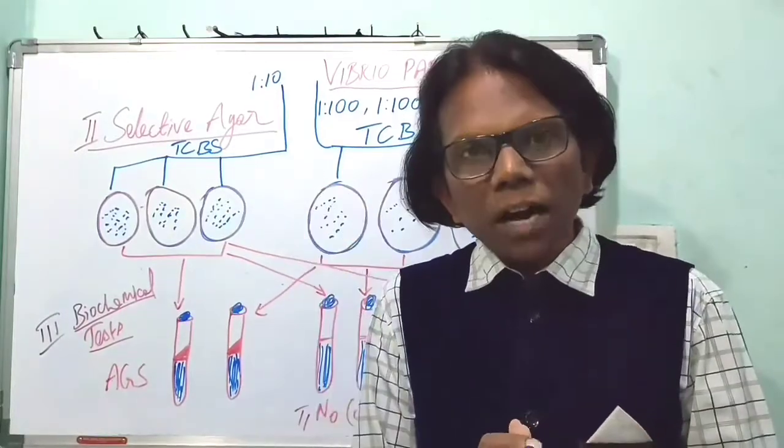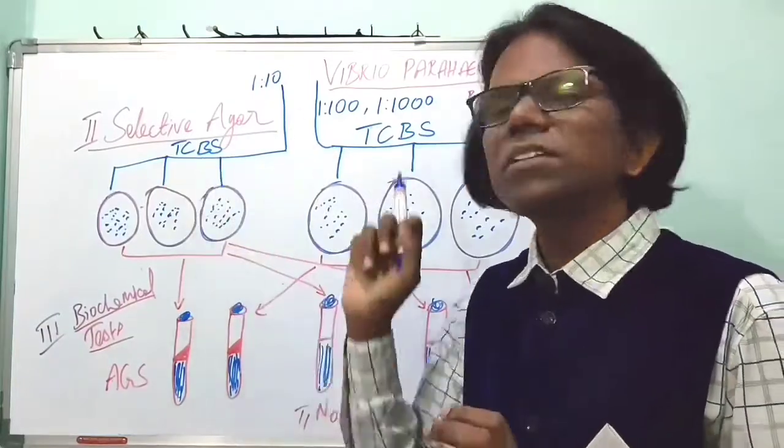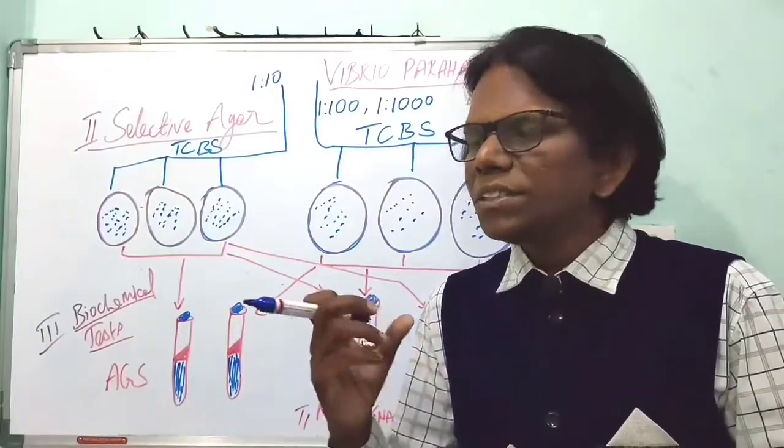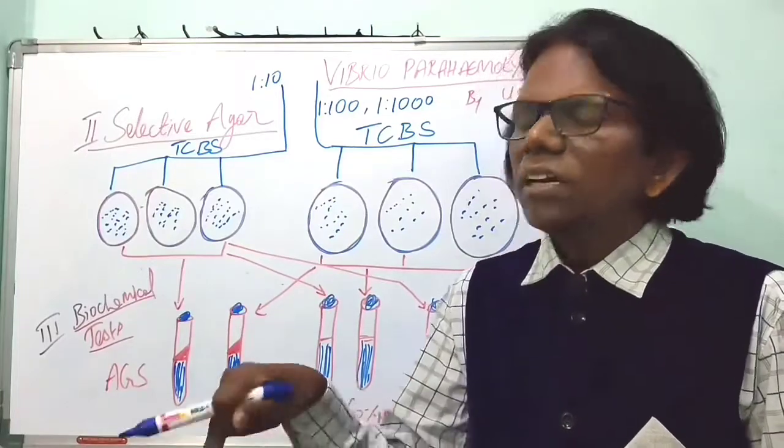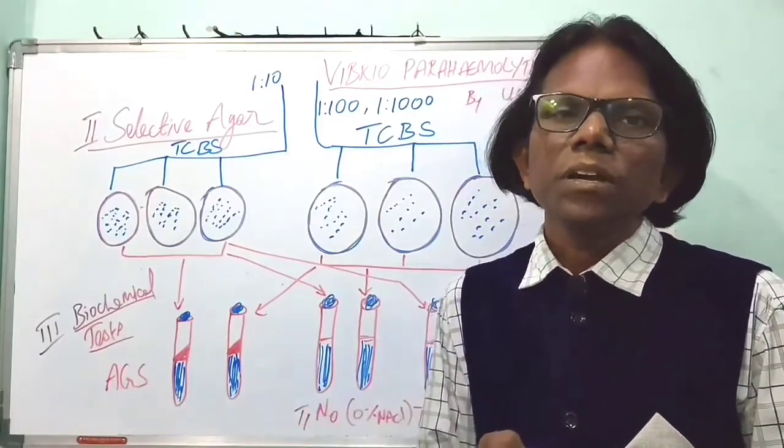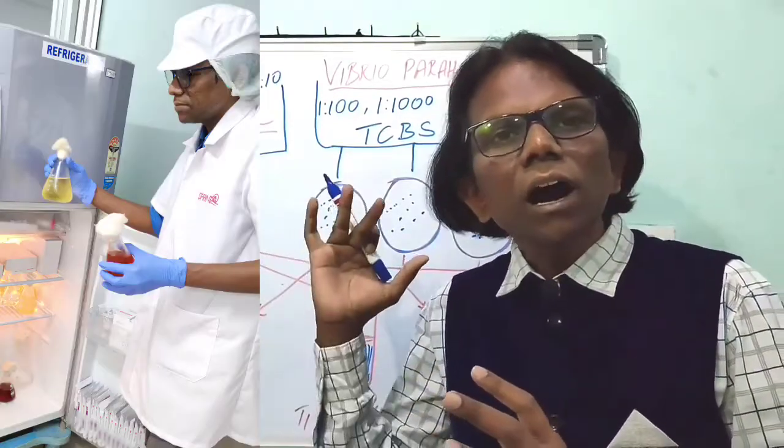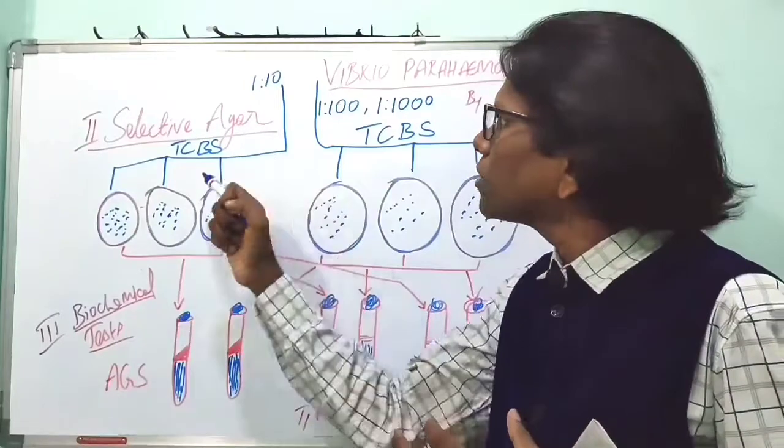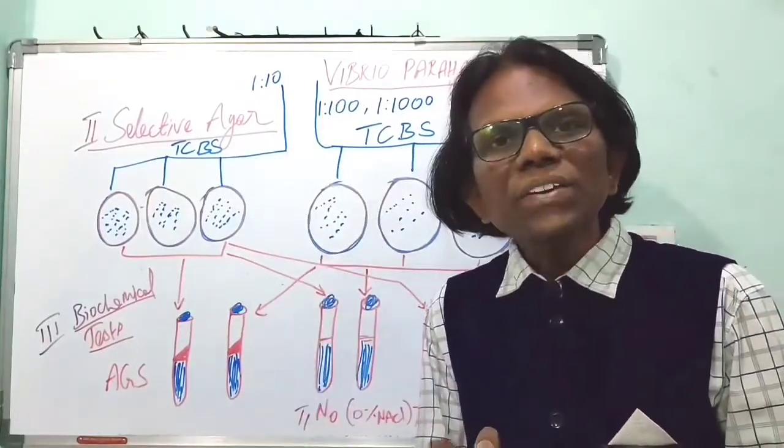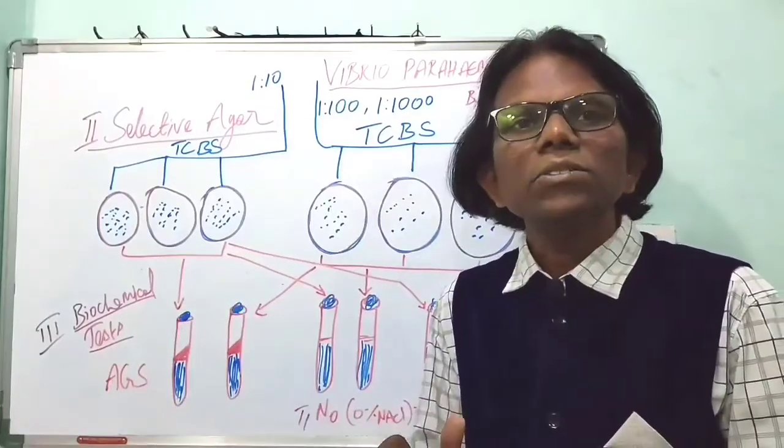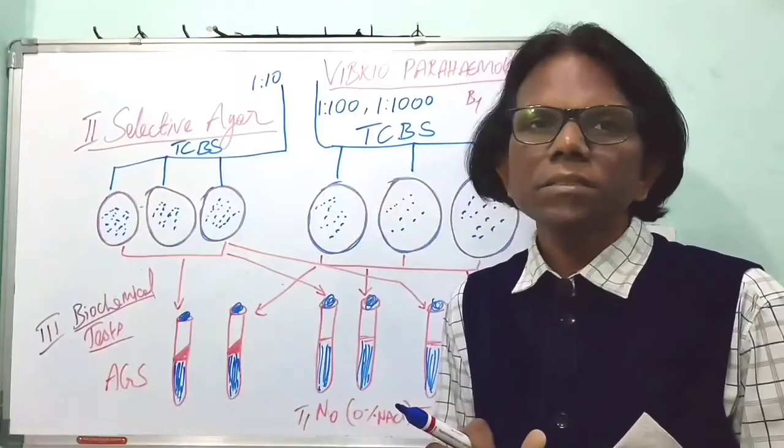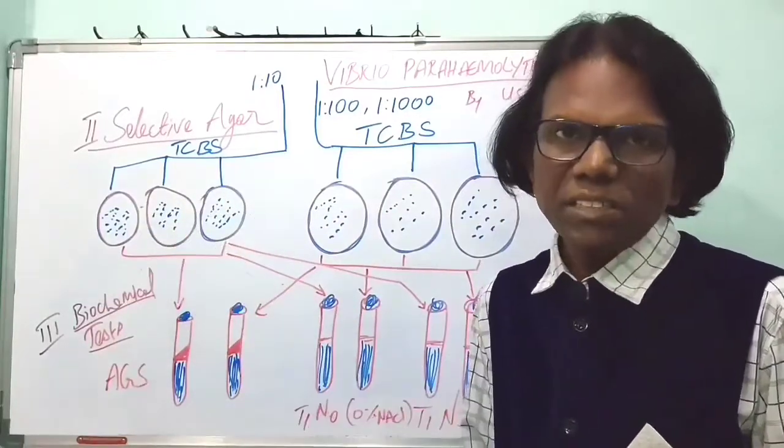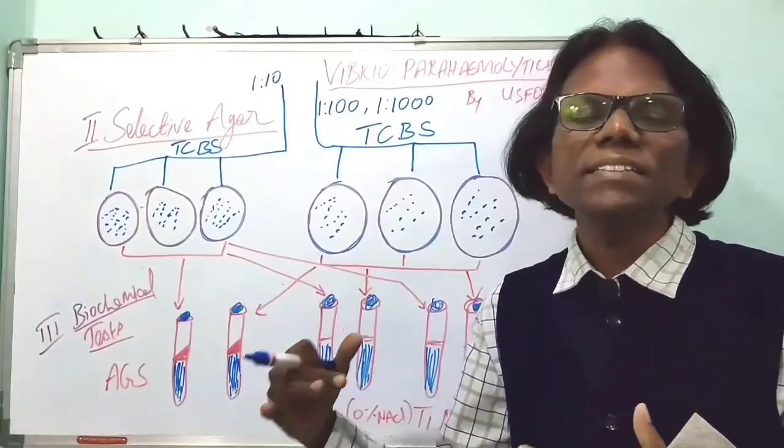Take 88.1 grams of dehydrated thiosulfate citrate bile salt sucrose agar medium and dissolve in 1 liter of distilled water. Gently boil the media. Agitate with constant agitation with stirring rod until dissolving all the media. We should not autoclave TCBS because autoclaving will denature the media. That is why we only boil the TCBS media. After boiling, pour the medium 15 to 20 ml in petri dishes to make surface dried TCBS plates.